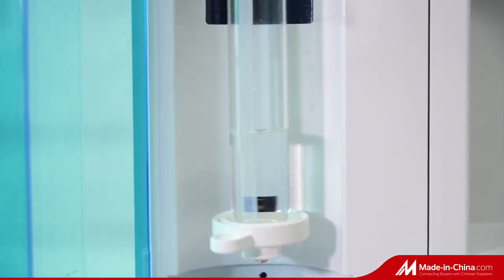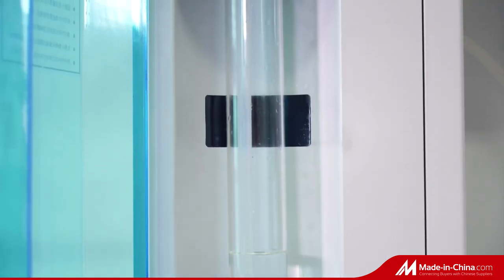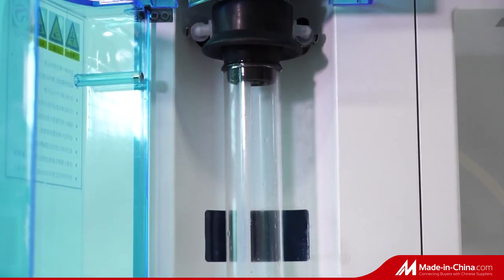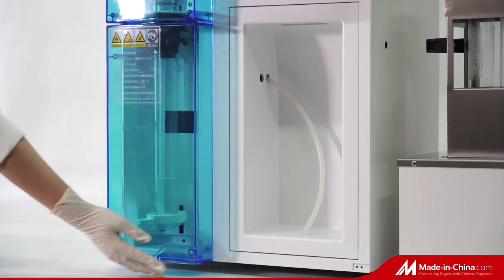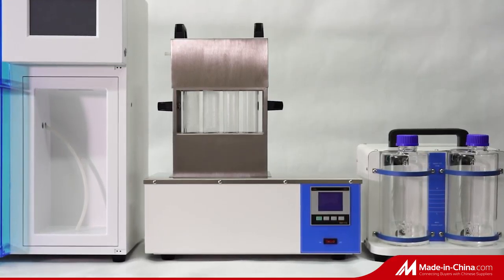The safety door material is 5mm thickness acrylic. When the door is open, the machine will not run and will keep alarming. 300ml digestion tube — if the tube is not placed correctly, the system will not run.